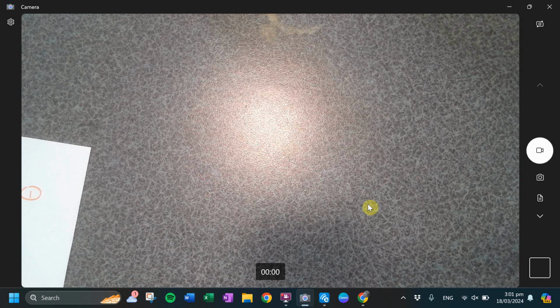So the best way to describe it is that it's kind of opaque. Does that make sense when I say the word opaque? It's not white, but you see something has formed when you look through it, and it's not going to capture on the camera as well. That's what I want you guys to do at your tables. It's an opaque kind of color forms. Yes. So you know, like opal, like the stone, it's kind of like white, but it's like a cloudy white. So that's what I would describe as opaque.